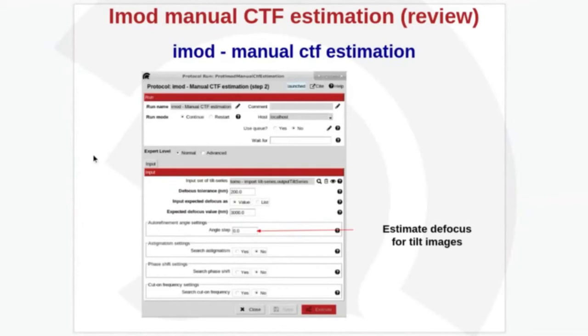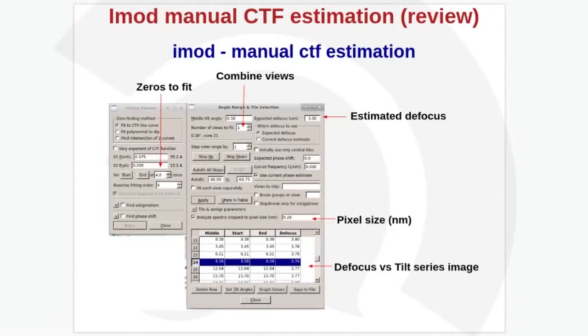Okay. So you saw this already with Federico and Vilas on the first day, but you ran step one, which was the automatic one. So Vilas also launched and showed you how to launch the manual one, but we will review it and we will see how it looks for the tilt series that we have worked with, which is the one from this tomogram. Okay, so the interface is a little bit tricky. It's got lots of windows, and let me show you just the things that we usually touch.